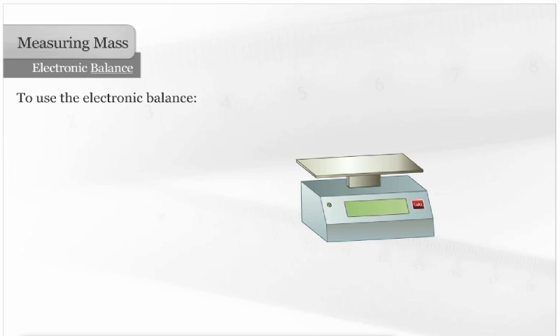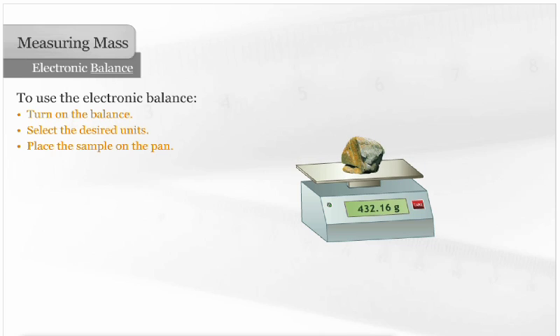To use the electronic balance, turn on the balance, select the desired units, and place the sample on the pan. The mass is displayed on the screen.